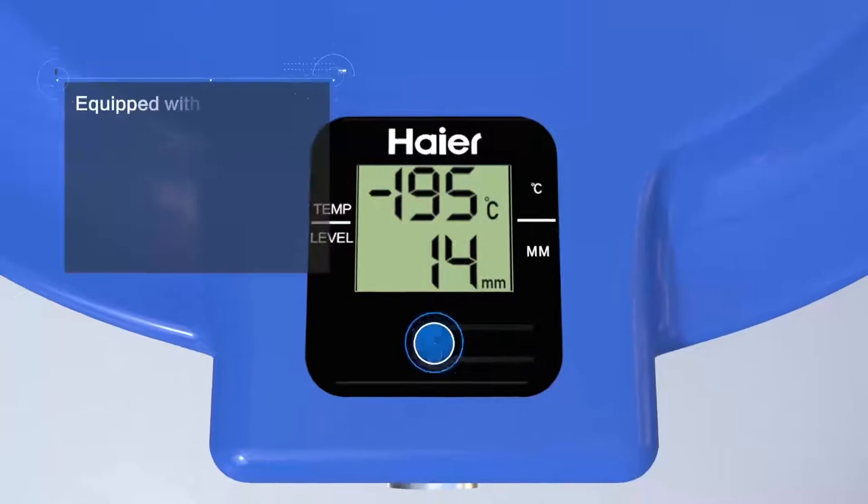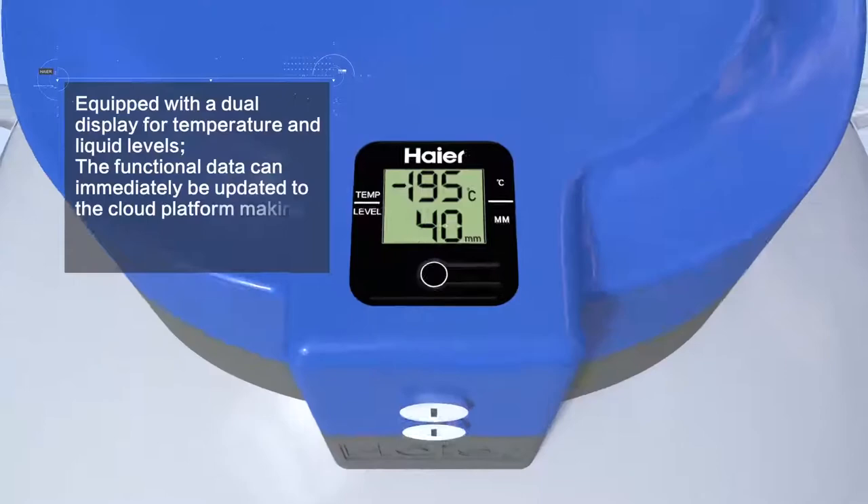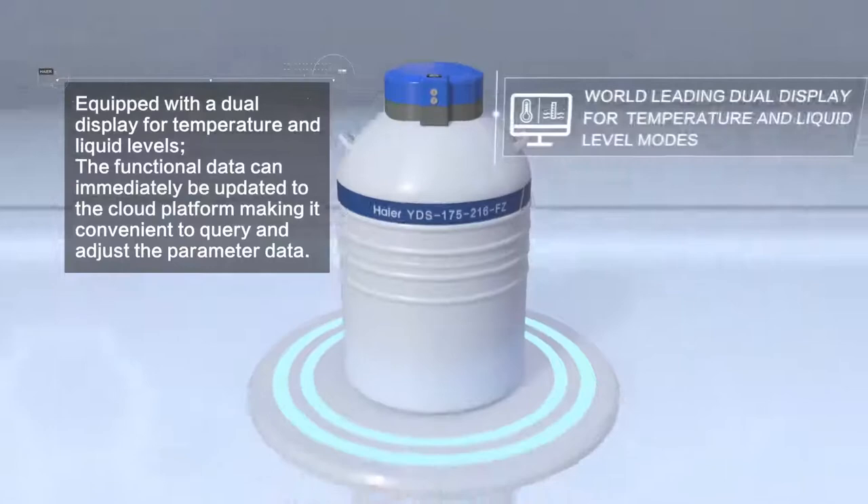Equipped with a dual display for temperature and liquid levels, the functional data can immediately be updated to the cloud platform, making it convenient to query and adjust the parameter data.